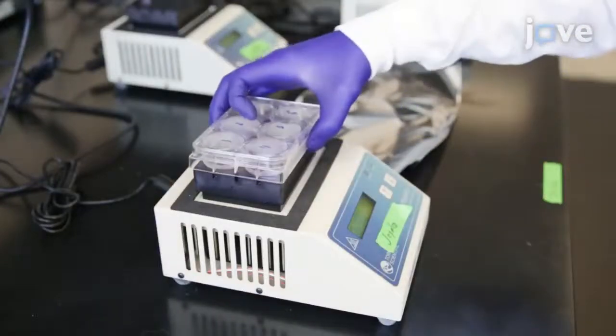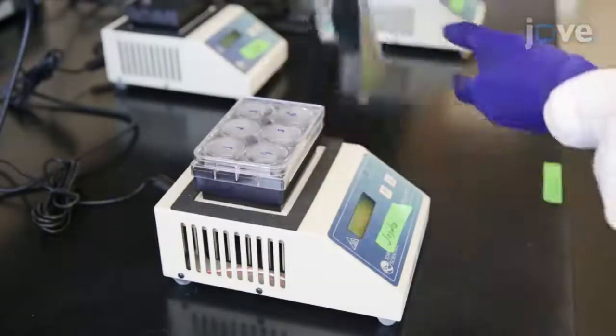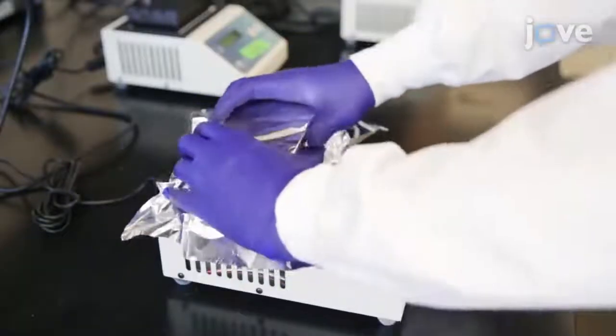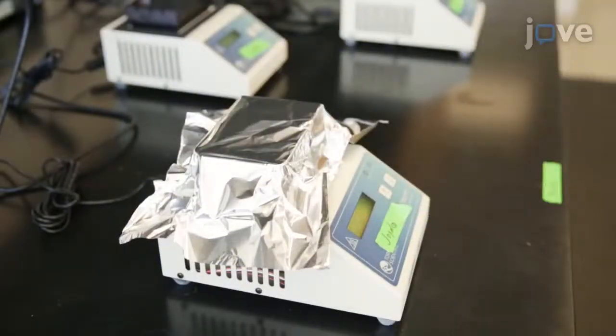Then place the plate on a 36 to 37 degrees Celsius heating block for 30 minutes protected from light. During the incubation phase, we recommend using a heating block to achieve a consistent temperature throughout the incubation period. Additionally, we recommend covering the cells with aluminum foil to prevent early activation of the photosensitizer.